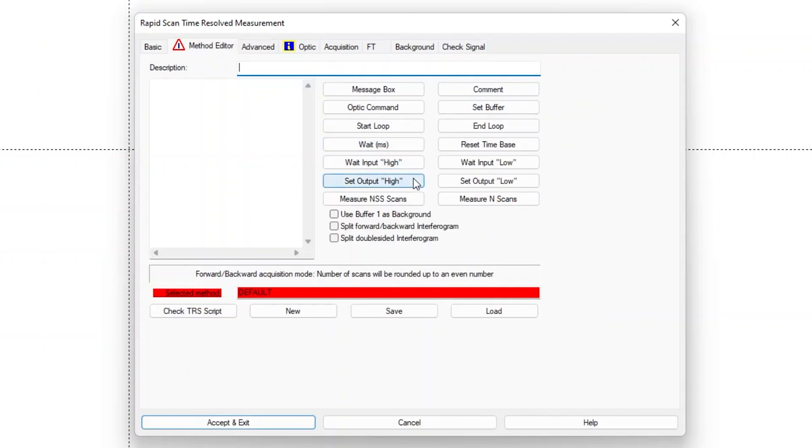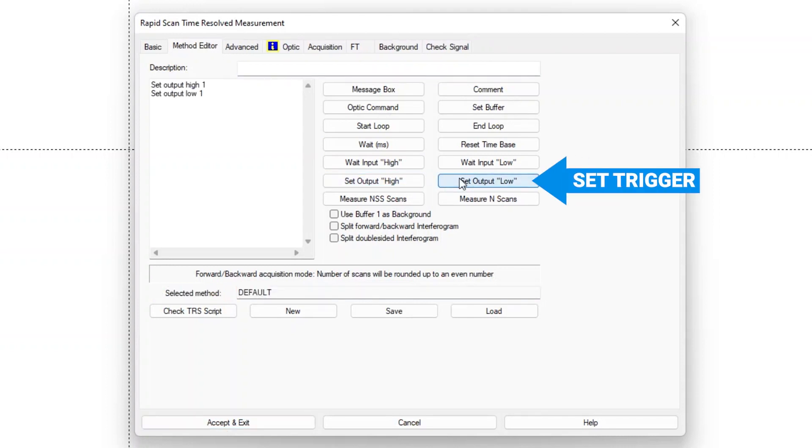The RapidScan function includes a method editor to make the user experience more convenient. For example, it includes flexible and advanced trigger options. The set trigger high and set trigger low commands are used if the spectrometer should be the master and send a trigger to start or stop the measurement or any other event. The wait input low or high commands are used if the external experiment or event should control the spectrometer.